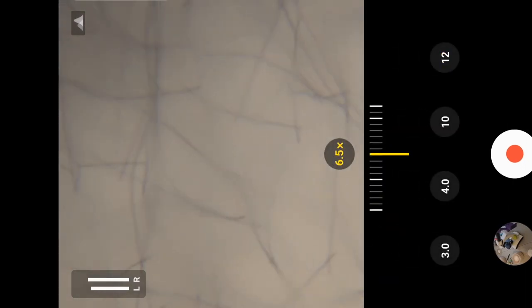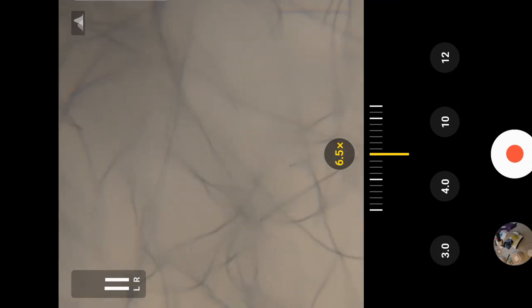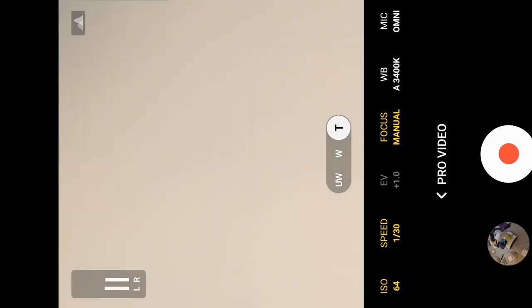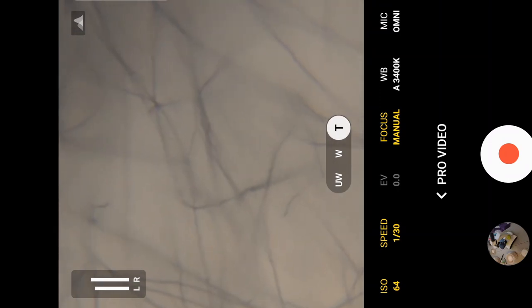So we'll just keep looking around the plate. But you see how tedious this is. It just takes time and you just got to look around. And it's what it is. I like using my phone in this mount because it's kind of tedious holding one eye closed, looking through your aperture. And you can't do this 100x trick. You would need a higher magnification and you'd have to plate out the mycelium. Yeah, there's another one that appears to be lacking a clamp connection. So I've lost track of the tally, but I think we're looking pretty good. I might go ahead and try to run this as a mono.